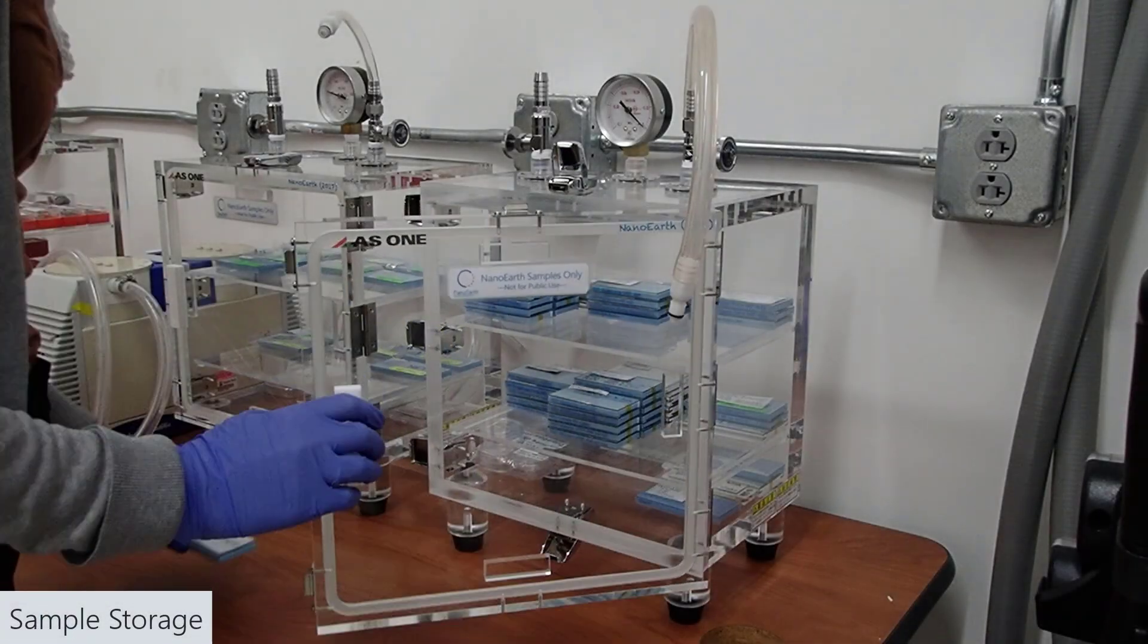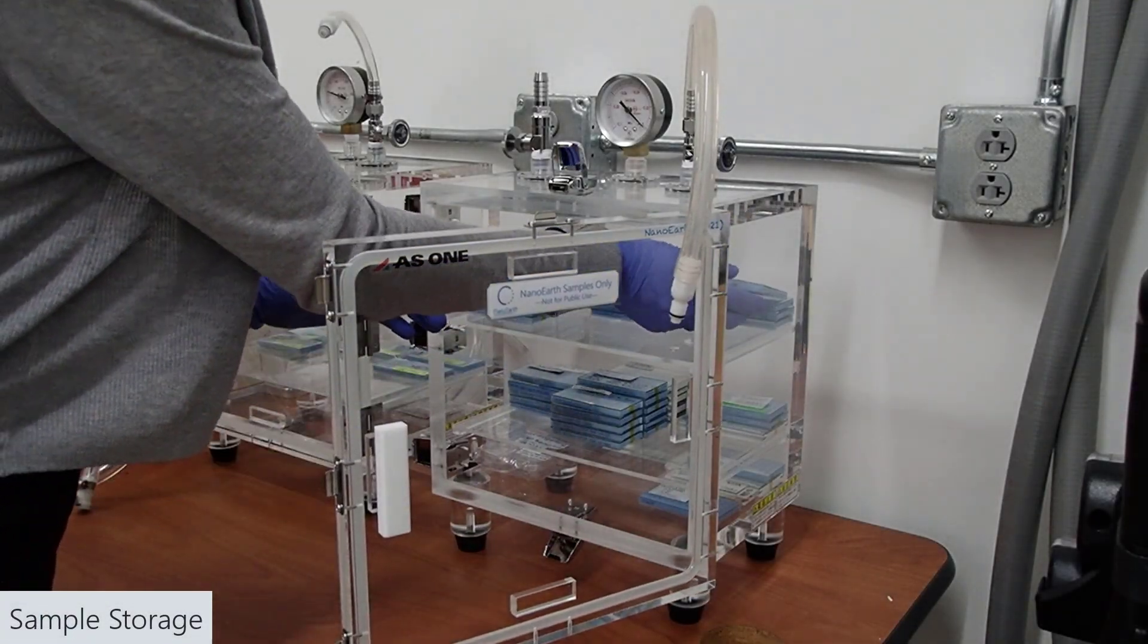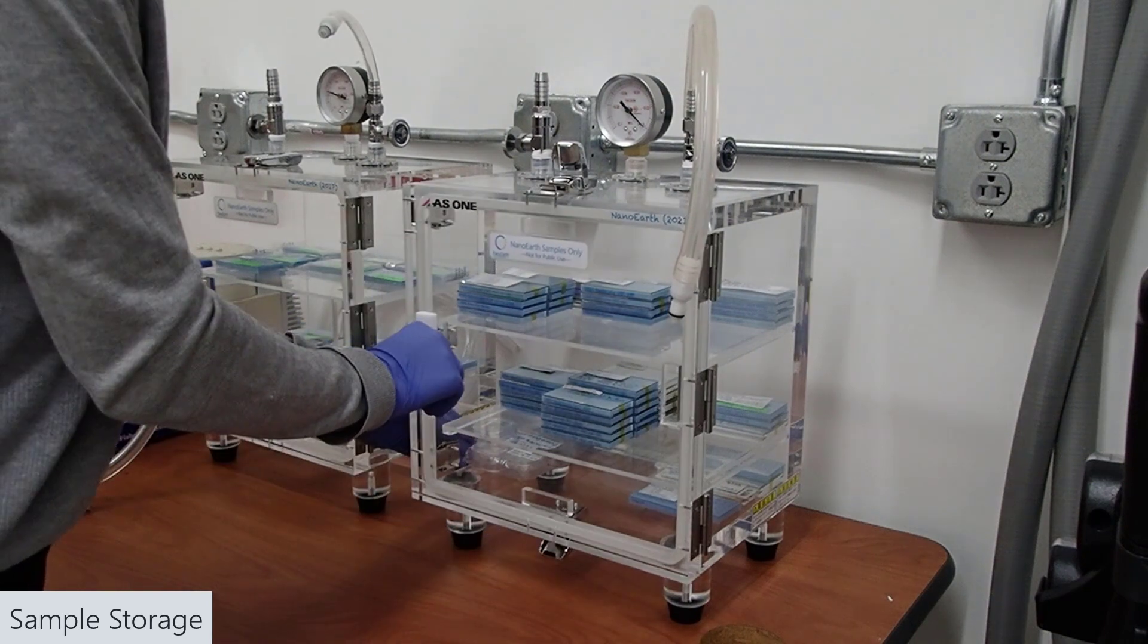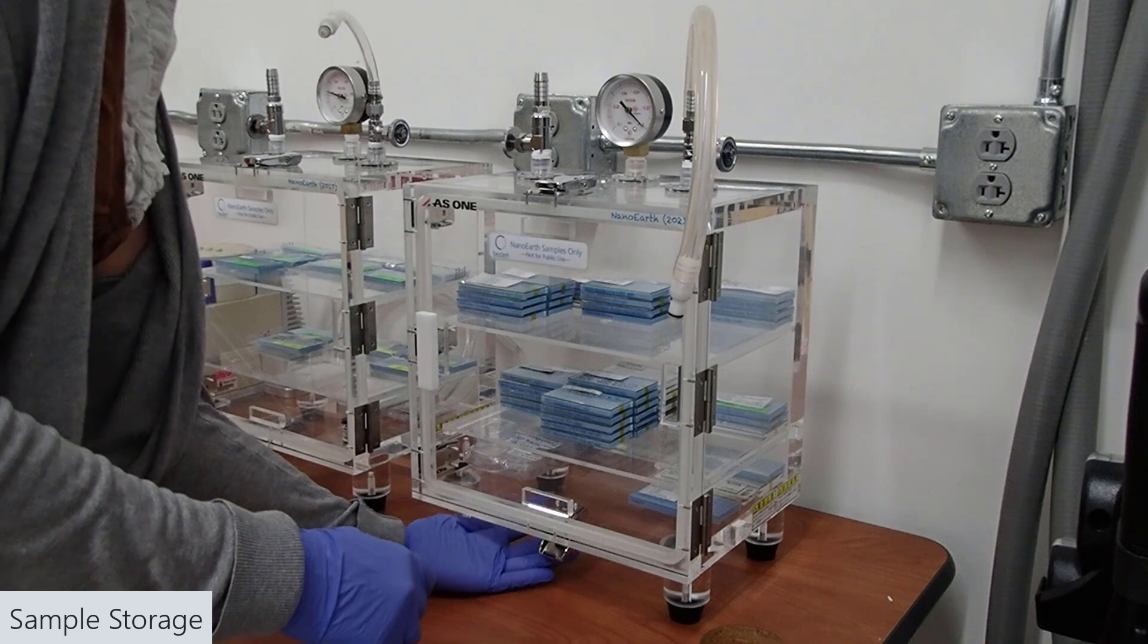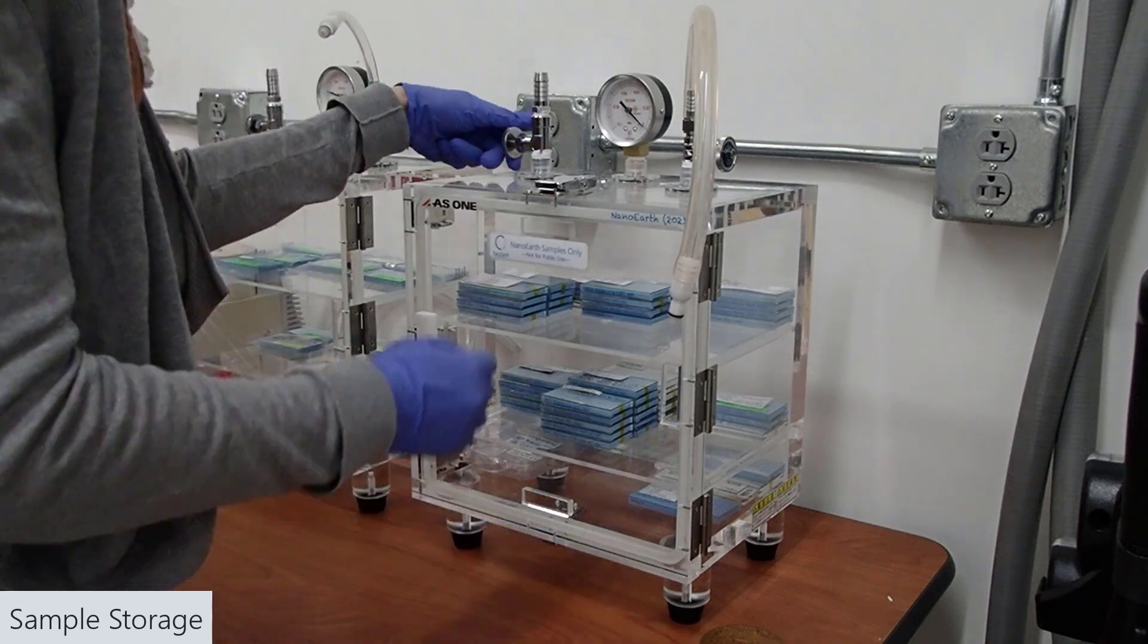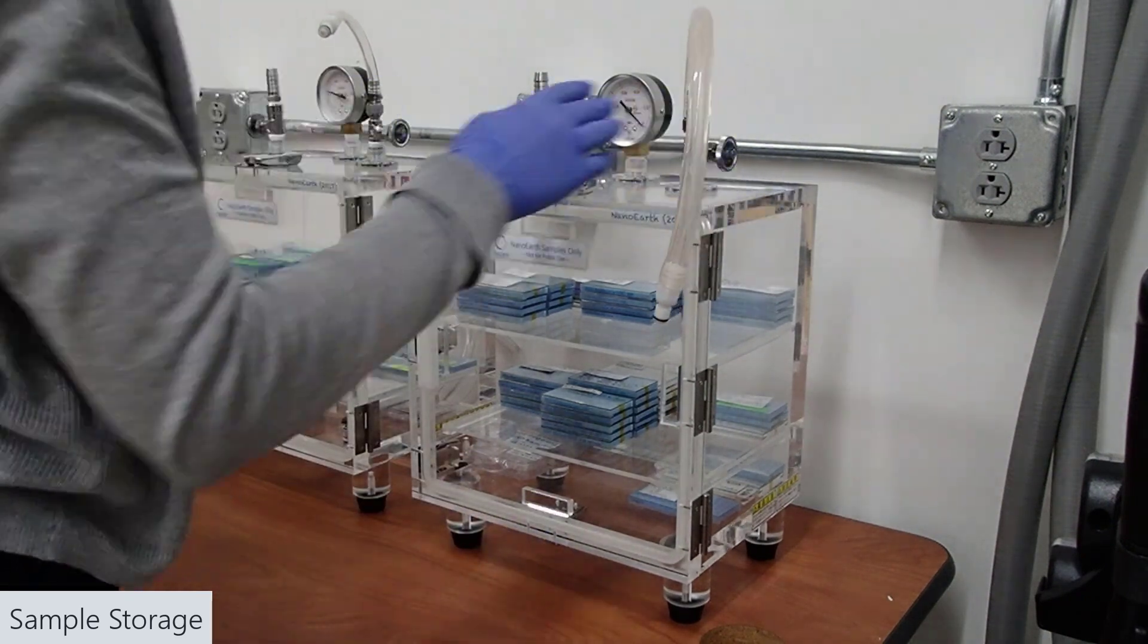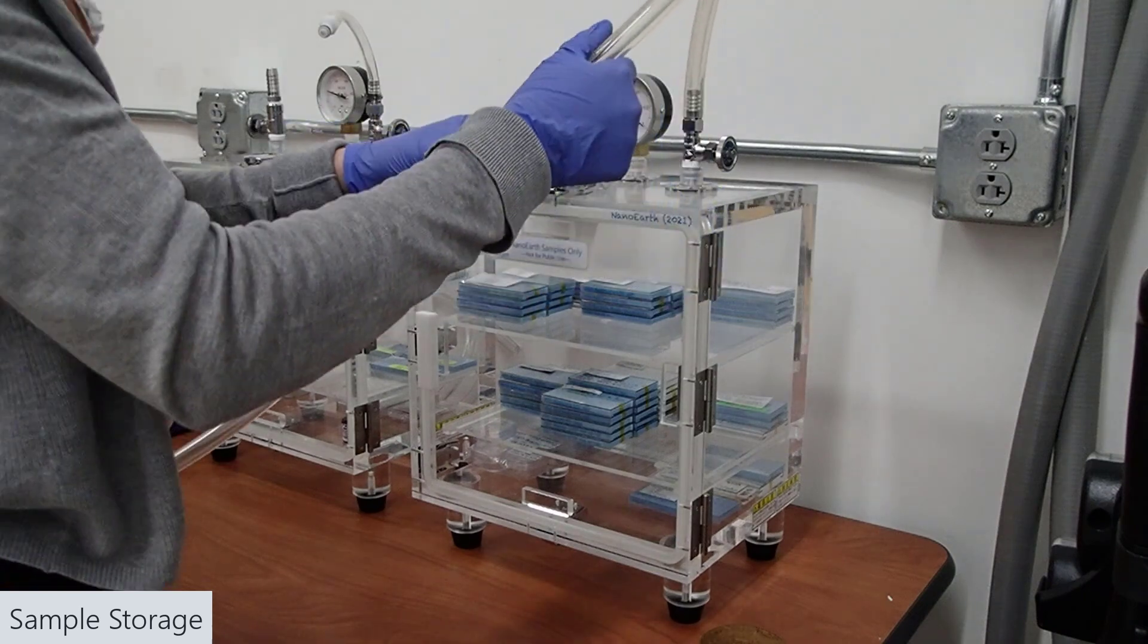And ideally, when you're not actively using your sample, you do want to store it in an inert environment. So, we have vacuum desiccators. You could also use a standard desiccator storage device that has nitrogen, for example. Whatever works best.